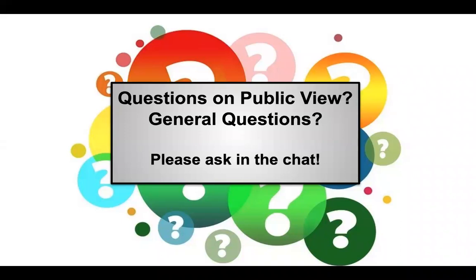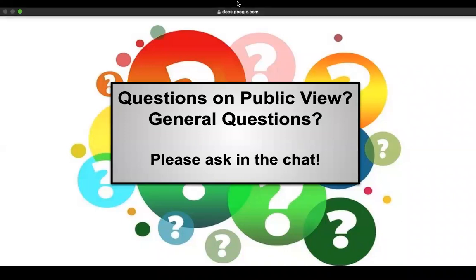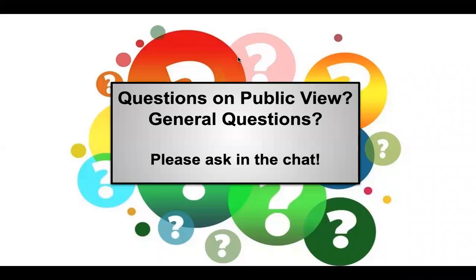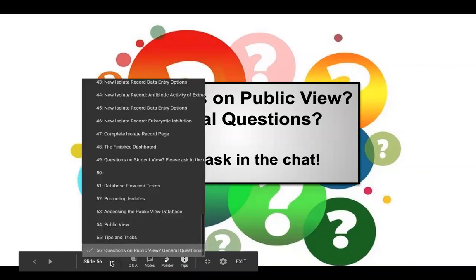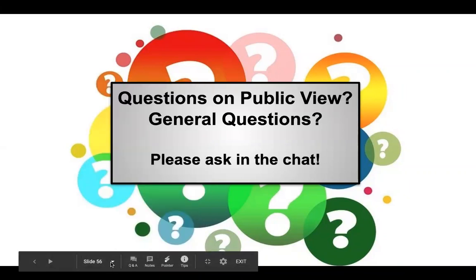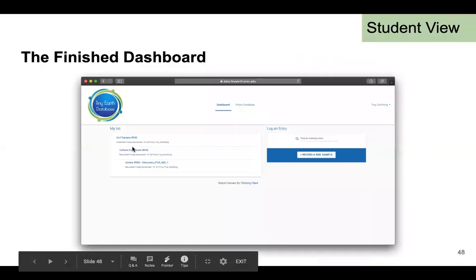So in terms of, actually, if we could go back to, Jen, can you go back to a slide that shows the structure of how, if you're on an isolate, it shows the hierarchy of the soil sample, culture condition, and then isolates underneath of it? Because I think maybe that can help.